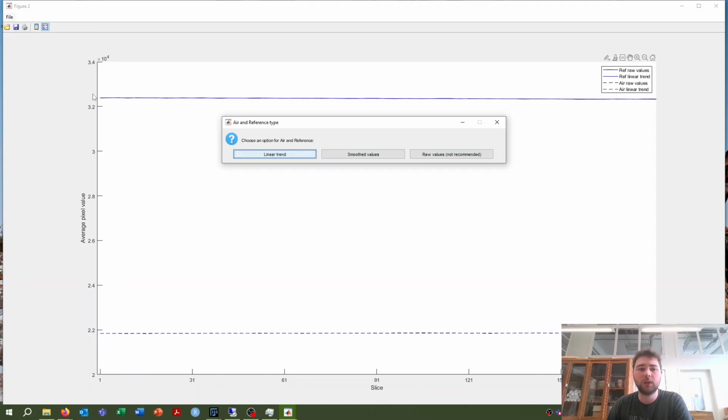So what the gray values are of the POM throughout my core, throughout my scan, and of the air throughout my scan. And so here you can see if there are any problems. So for example, there's a big dip for some reason because you accidentally put a little bit of plastic in it, or like the air hole wasn't completely clean. But here it's nice and straight, so it looks perfect.